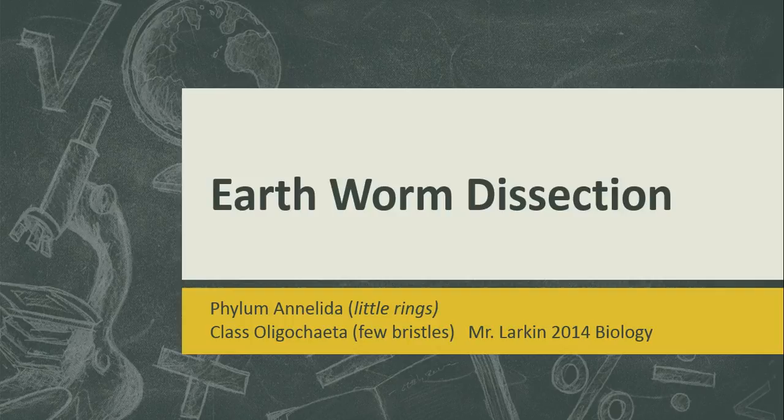You will keep these drawings in your portfolios and use them to further study for the practical at the end of the course. I want you to feel comfortable with this assignment and come to class prepared to begin when you arrive. We will now take a look at the objectives, materials, and purpose of the dissection.